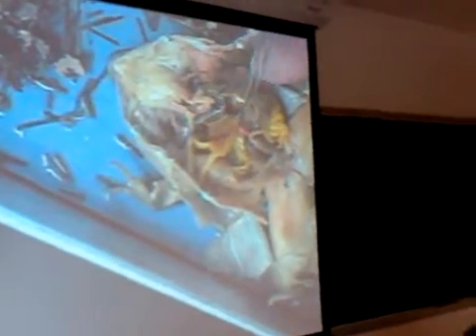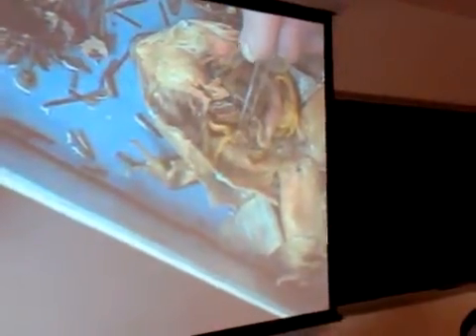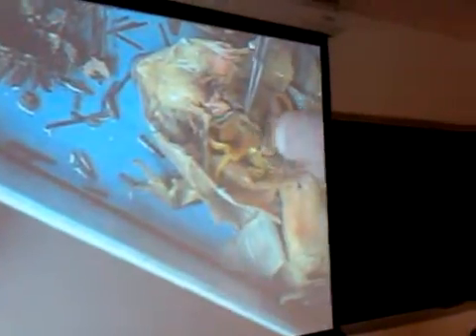Right? There is the... Does everybody see the small intestine right there? If it's not obvious, then tell me. I mean, I'm picking it up, but there's the small intestine. Stomach, right? Small intestine. Got it? Small intestine leads to what? Large intestine.